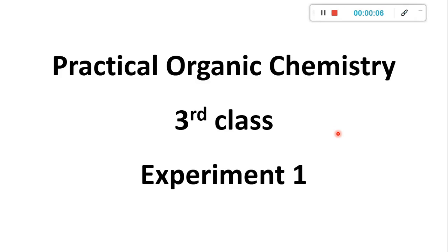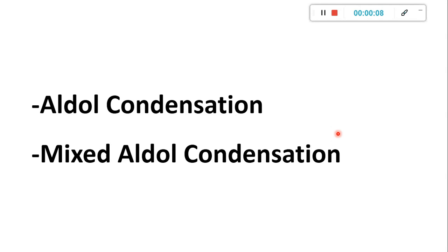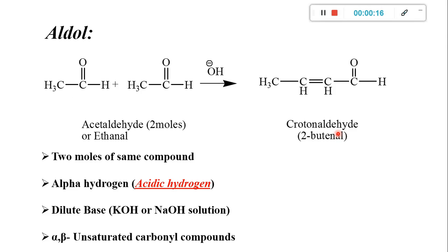Today we're going to talk about aldol condensation and mixed aldol condensation, the first experiment for the third class organic chemistry. Aldol condensation, this reaction is related to carbonyl compounds, especially aldehyde and ketone, because they don't have any good leaving neighboring group at this position.